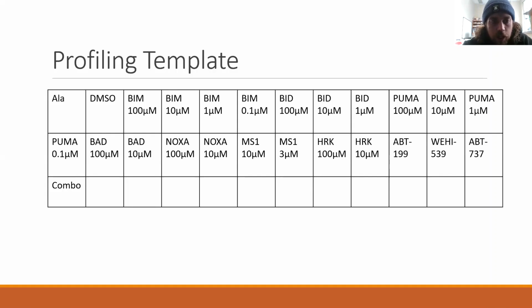It's nice to see a dose-dependent response to the activators, as well as we can use these higher dilution sample wells to assess how primed the cell is, because if it's responding at high dilutions, low concentrations, it means that cell is probably highly primed.